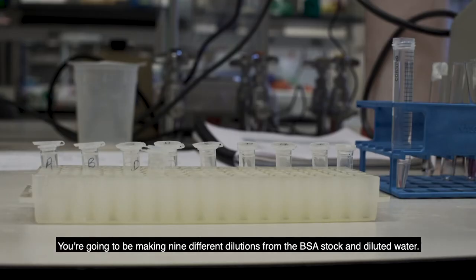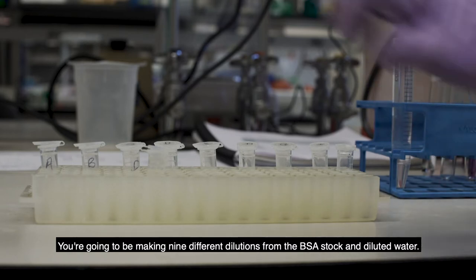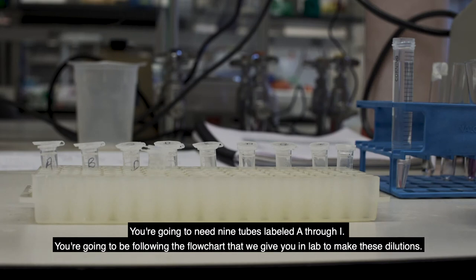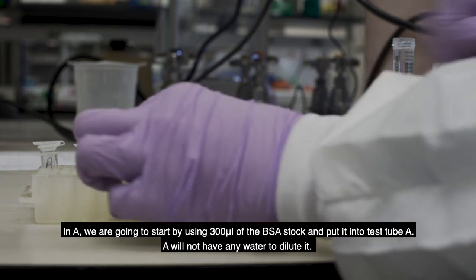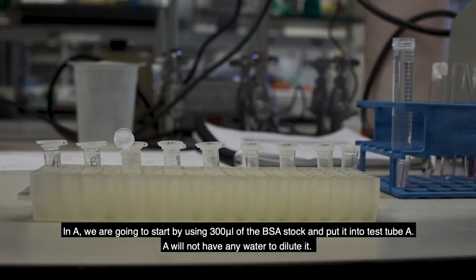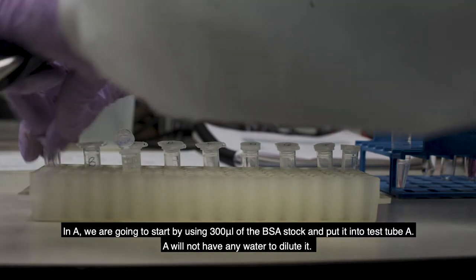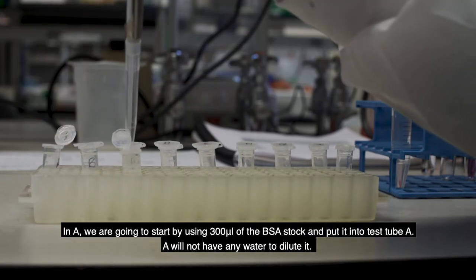You're going to be making nine different dilutions from the BSA stock and then diluted water. So you're going to need nine tubes labeled A through I, and then you're going to be following the flow chart that we give you in lab to make these dilutions. But for demonstration purposes, I'm just going to go through how to make the first three. So in A, we're going to start with using 300 microliters of the BSA stock, and then we're going to put that into A, and A won't have any water to dilute in.